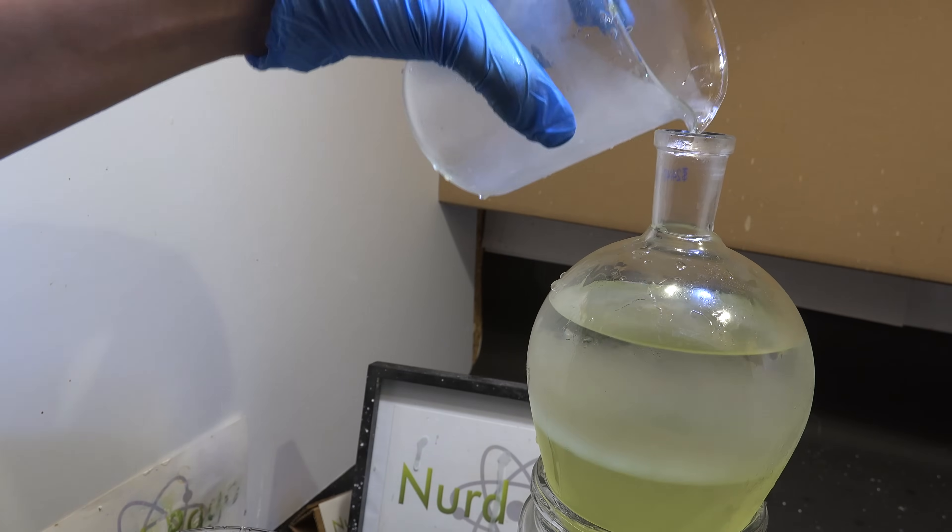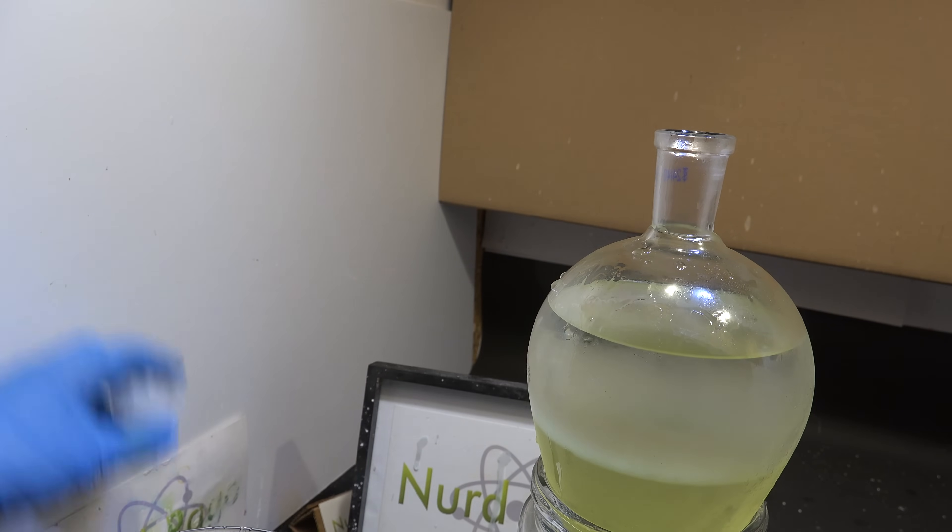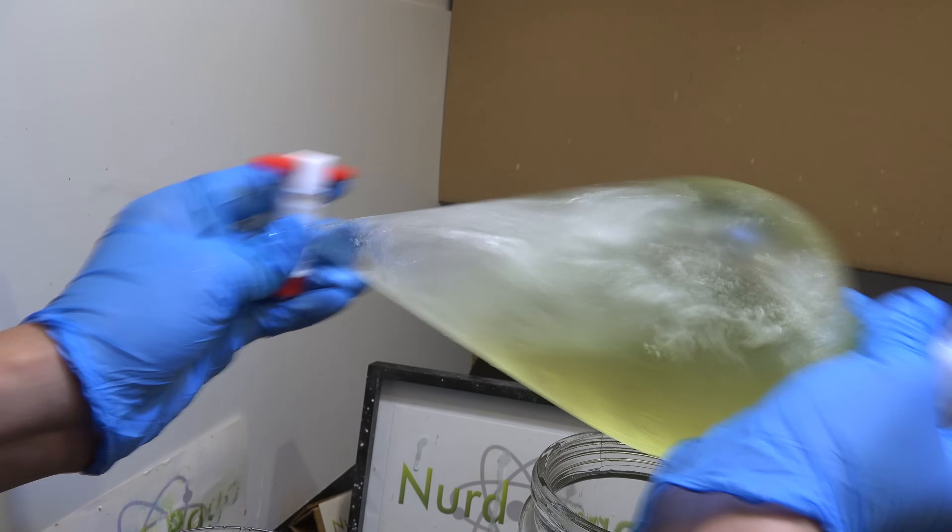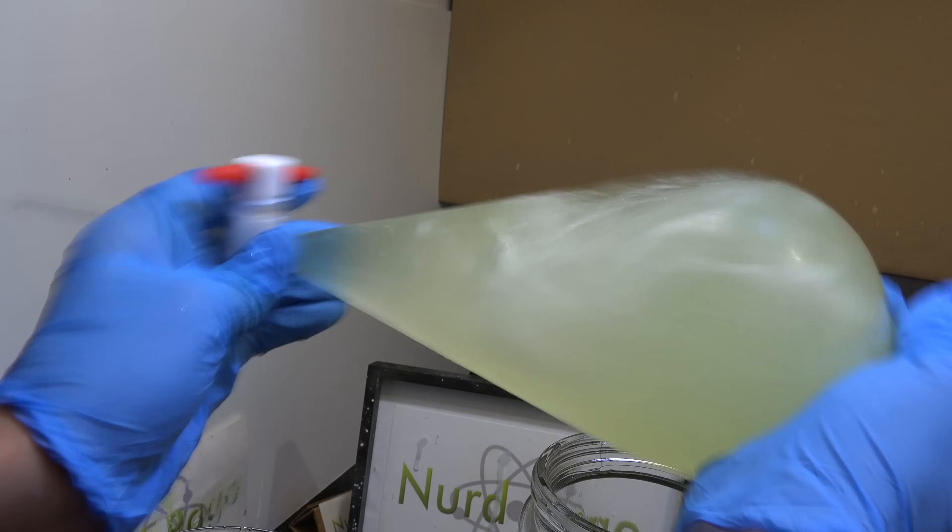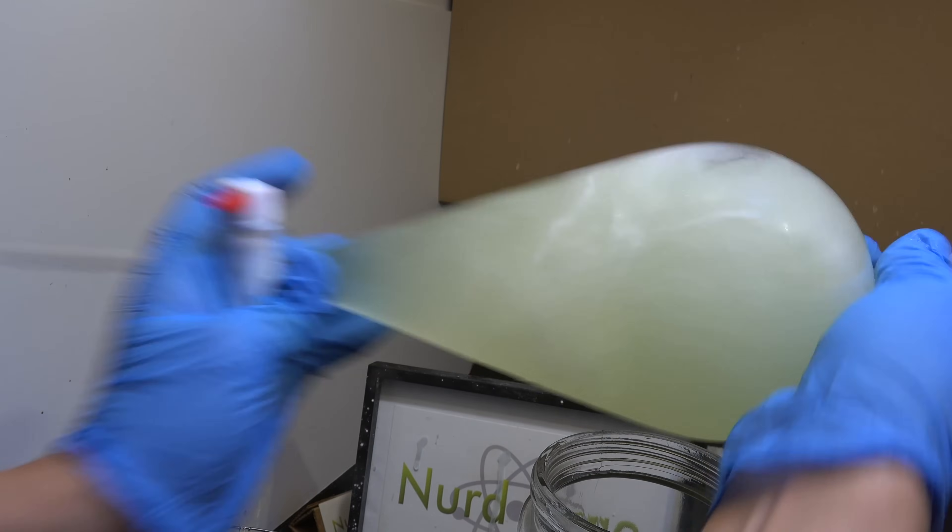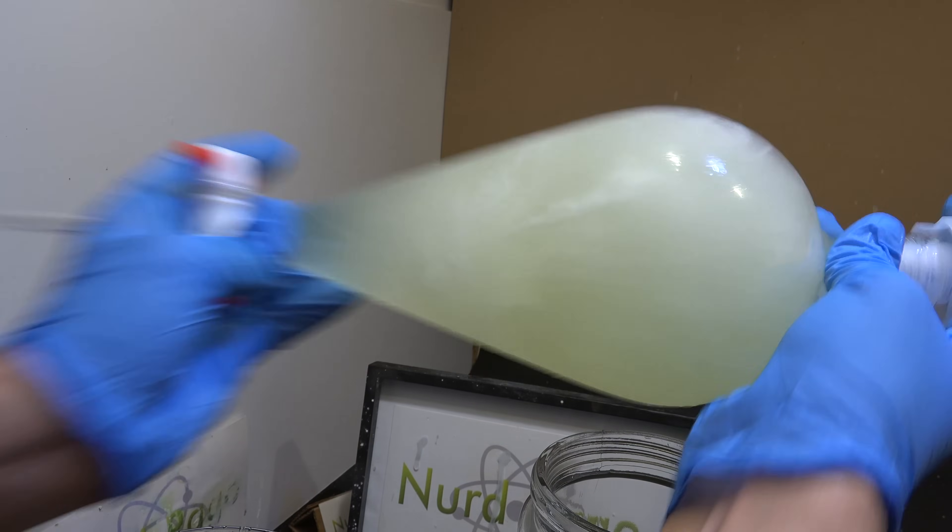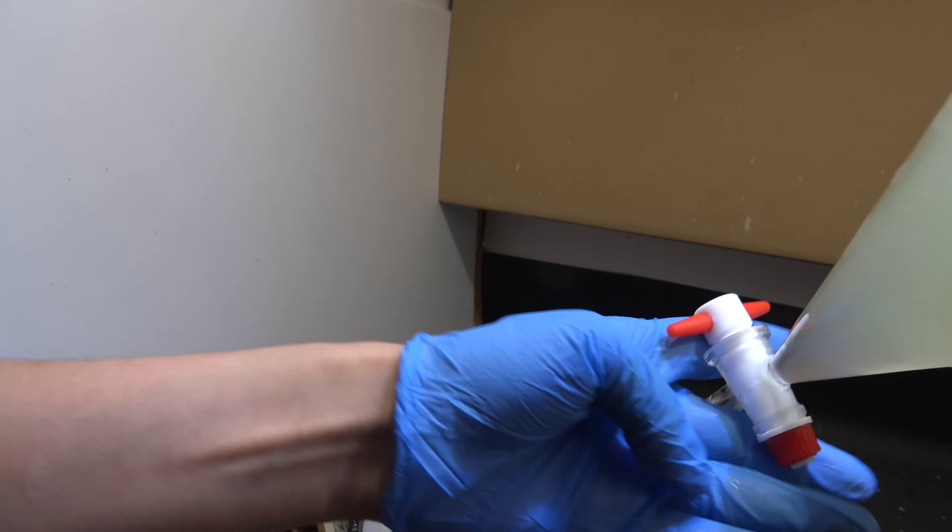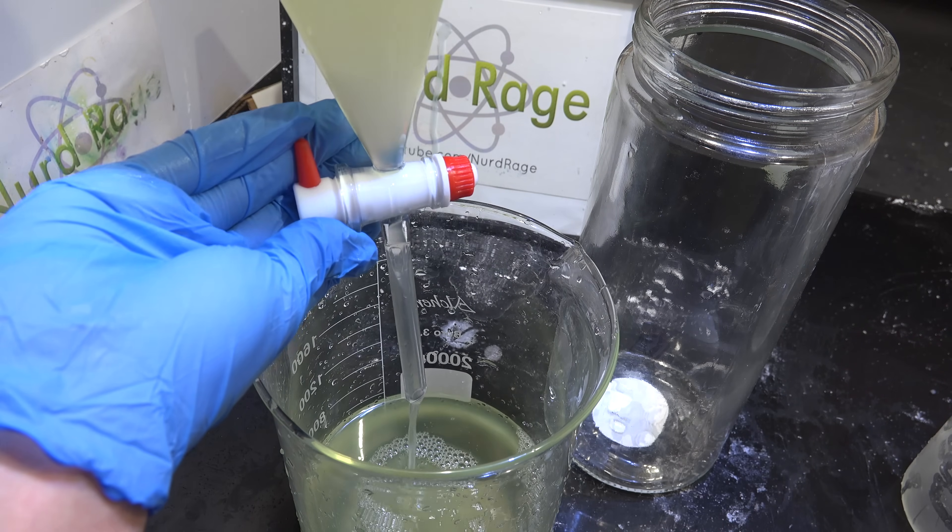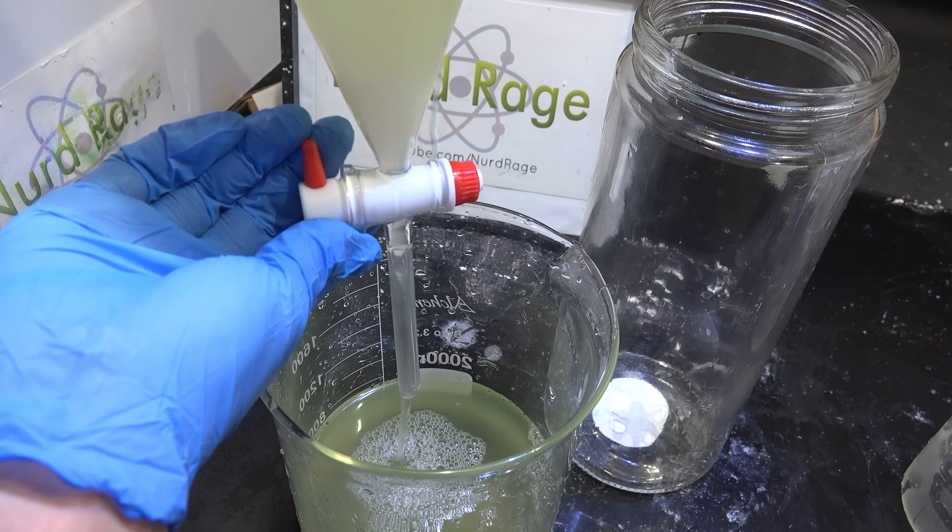Now you professional chemists are probably yelling at the screen right now. Extracting it this way is not as efficient as using fresh ether with fresh solution. I'm doing it this way because this is all the diethyl ether I have so I have to reuse the same amount. I'm not going to recover all the gallium possible but at least we'll have enough to demonstrate the process. Anyway, once again drain off the aqueous layer and extract more solution until you've gone through it all.